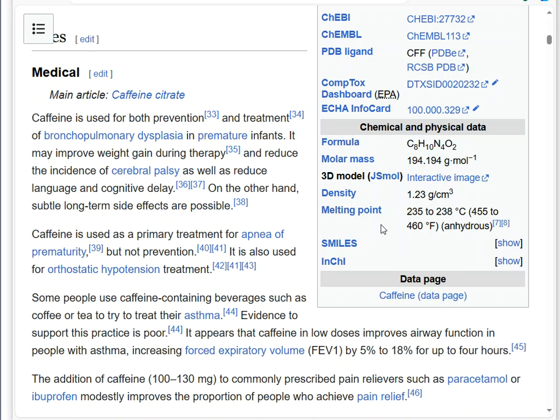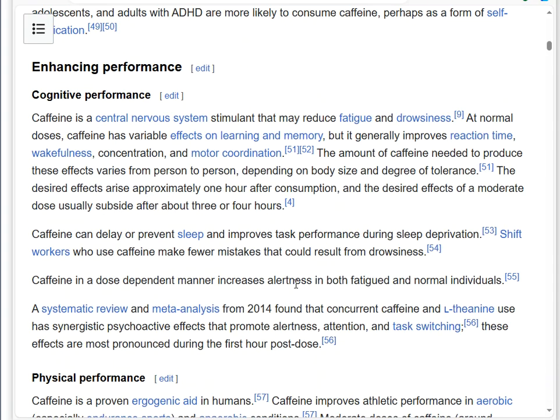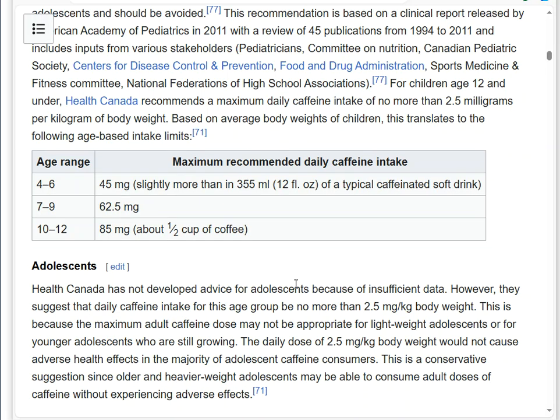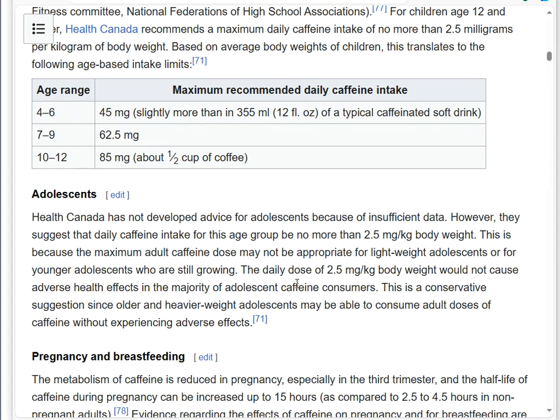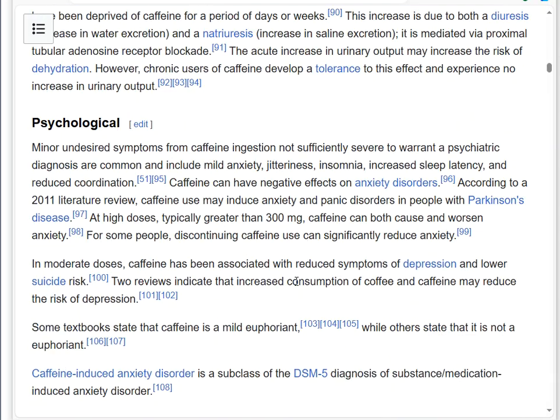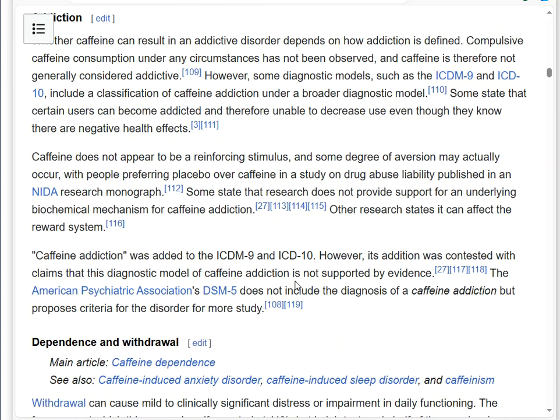So I hope that when I extract the caffeine in this lab procedure, one of the ways that we can make sure that it's caffeine is to check the melting point of it. Very easy, very simple process that we can do just to confirm it before we go a little bit further. But as I scroll through, like we've said before in lecture, Wikipedia is going to do a very poor job of giving you lambda maxes and molar absorptivities and those types of things, which are very important for the UV world.